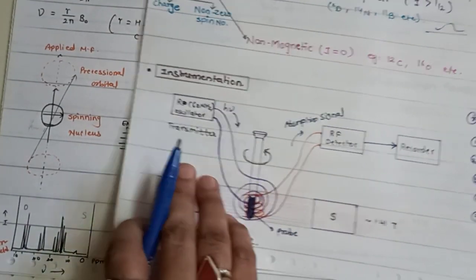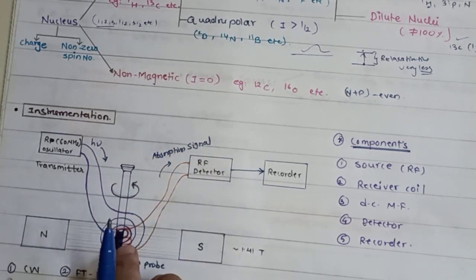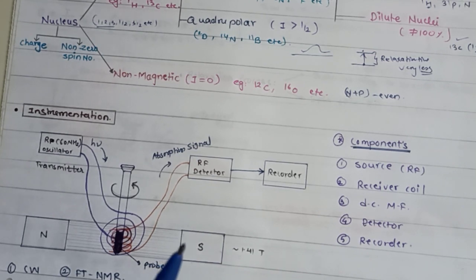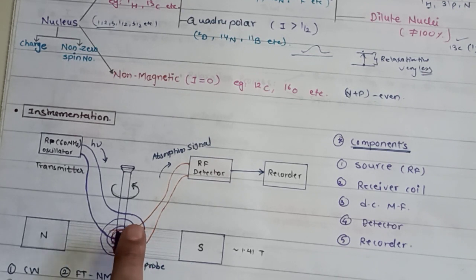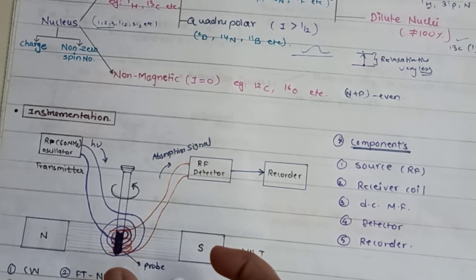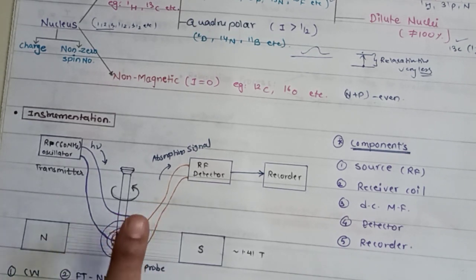Now here the second thing is the sample which you keep in the sample tube, the NMR tube. That tube has to be very properly hard glass की होनी चाहिए. तो यहाँ पे जो होता है फर्स्ट जो कंडीशन वो है NMR tube selection. So for recording the NMR spectrum we should use a high quality NMR tube, with a diameter generally depending upon the coil diameter of the NMR probe which is in the magnet. Second, we should not use a 5 mm NMR tube in a 10 mm probe unless we have no choice.